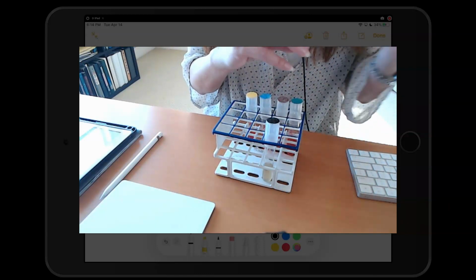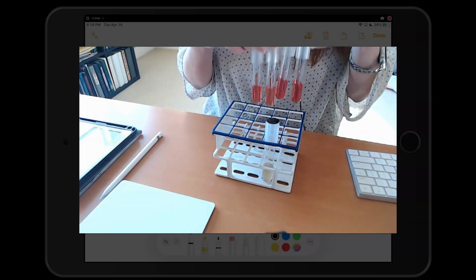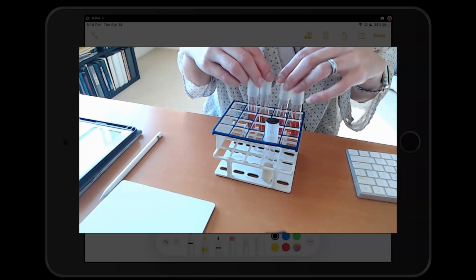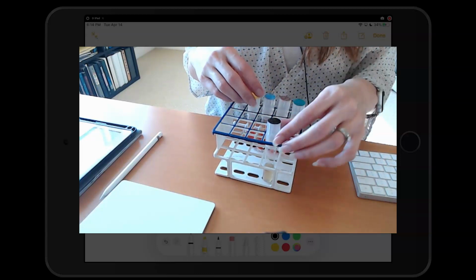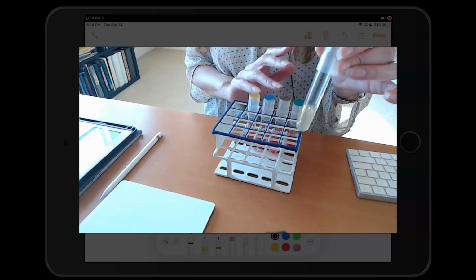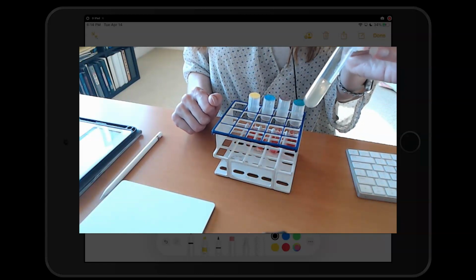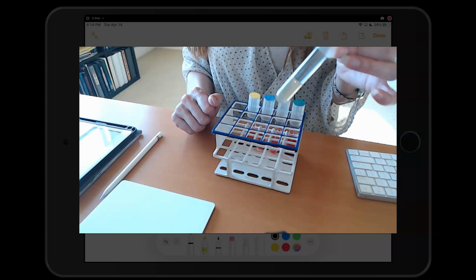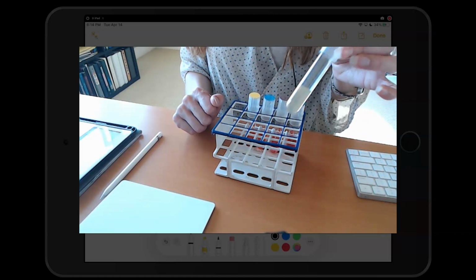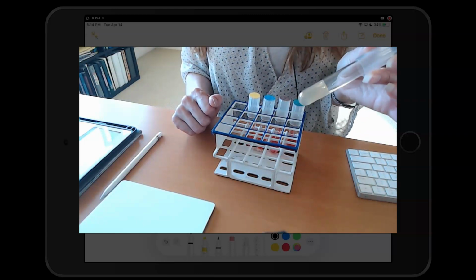But unlike the carbohydrates that require an 18 to 24-hour incubation period, the gelatin requires almost about a week and a half. It takes a while. So we're going to incubate it at 37 degrees or 25 degrees, whatever the optimum growth temperature of the unknown is, for about a week and a half.